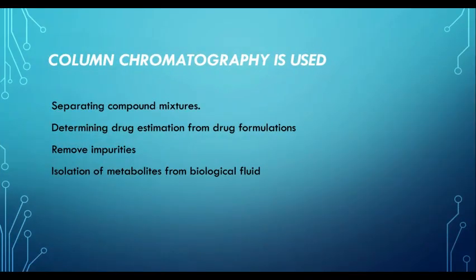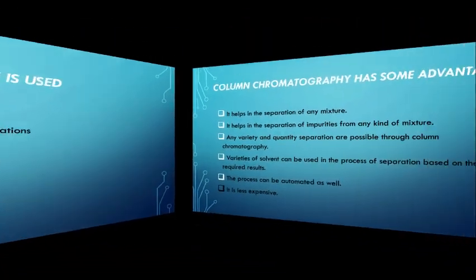Column chromatography applications: separating compound mixtures, determining drug estimation from drug formulations, removing impurities, isolation of metabolites from biological fluids.